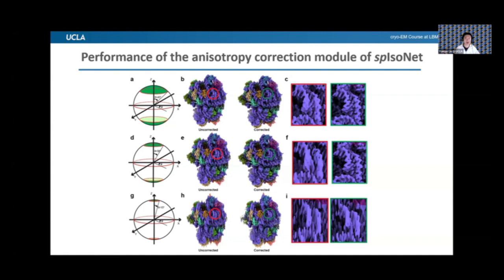It even helps in the tomogram. And if it's a very bad tomogram, it will not cause artifacts, because it was designed not to add more information, so it becomes more trustworthy. So this is that.